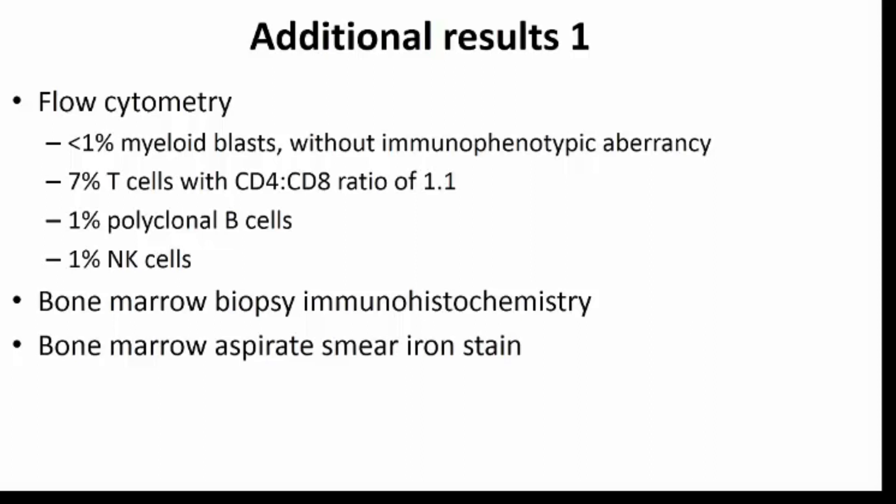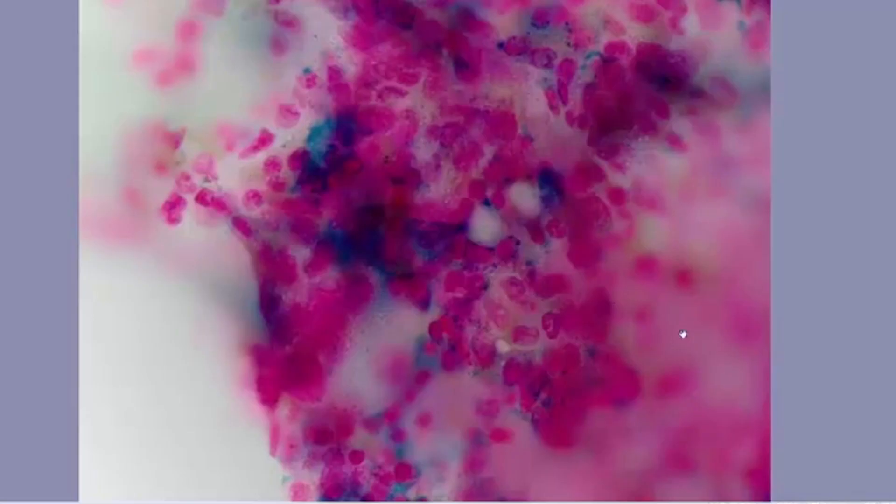I do think it is critical to do an iron stain in every bone marrow done for anemia, to look for ring sideroblasts. This should be done on the aspirate smear because iron leaches out in the biopsy, making it not very sensitive. Here's a high-power view of a spicule on the iron stain, which was excellent, similar to the bone marrow aspirate GEMSA stain. I like to look first in the spicules because you can see the presence of storage iron here, which right away excludes the possibility of iron deficiency — which you might have considered given the patient's microcytosis. However, it also shows what appear to be ring sideroblasts here.